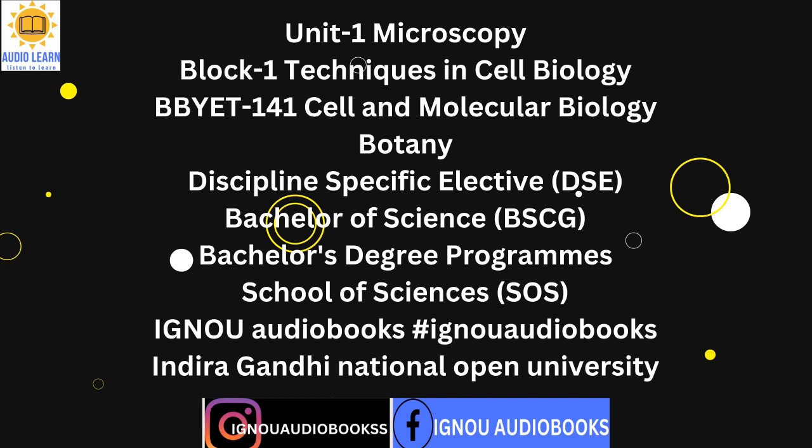In this unit, you will study about the various aspects of the microscopy techniques and how microscopy helped to understand the structure of cell. An update about various types of microscopy will also be provided to you.